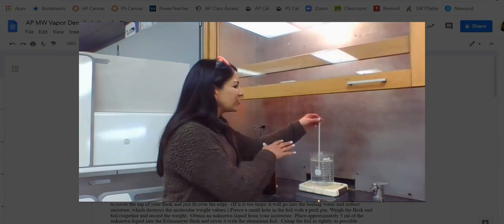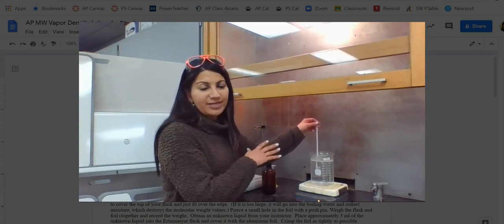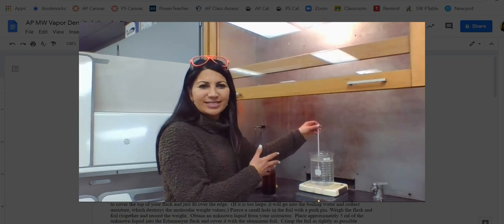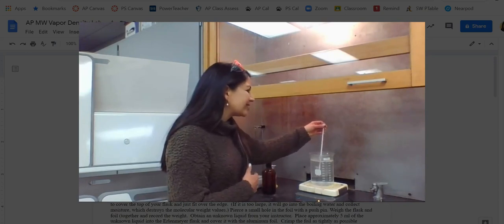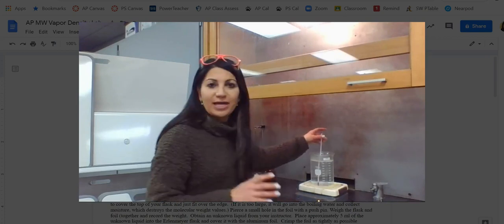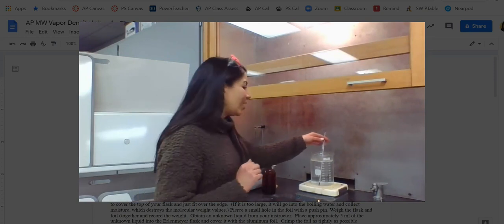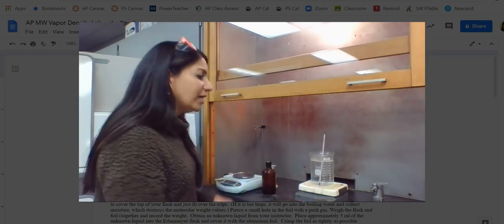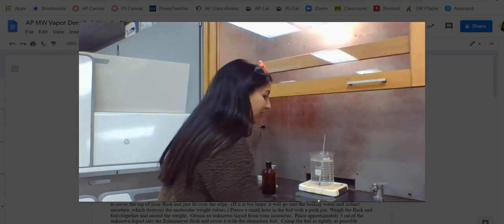So since that's the case, then if I look at this, now this thermometer is not mercury-based, it's alcohol-based, and so they really aren't calibrated perfectly. And so this does look like it's about 101, but we're not going with that. We're actually going to put that our water is going to be boiling at 99.5 degrees Celsius. Just to kind of account for any error in that, that should actually help us out a little bit.